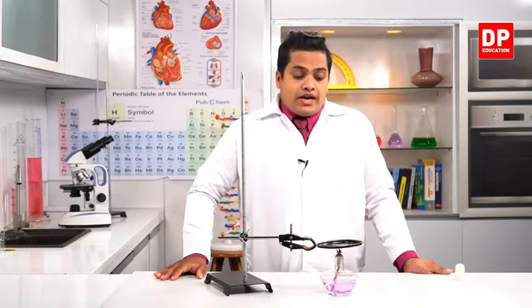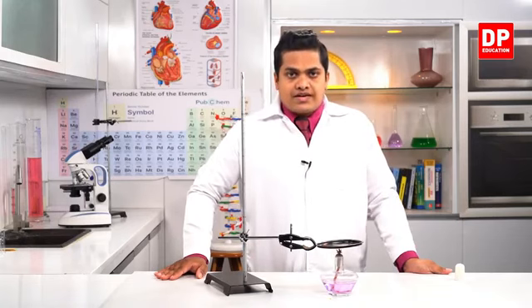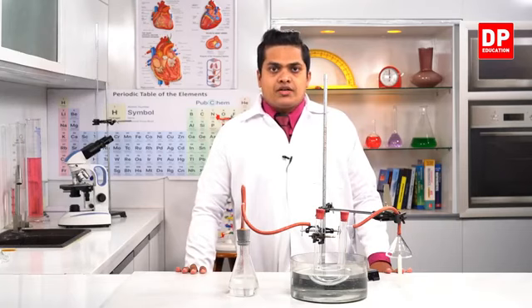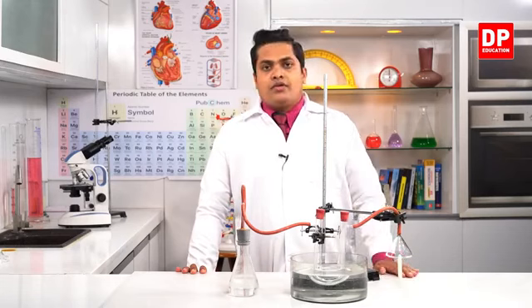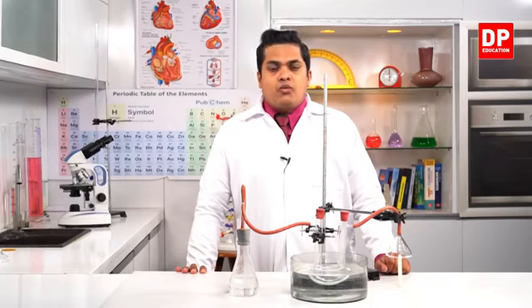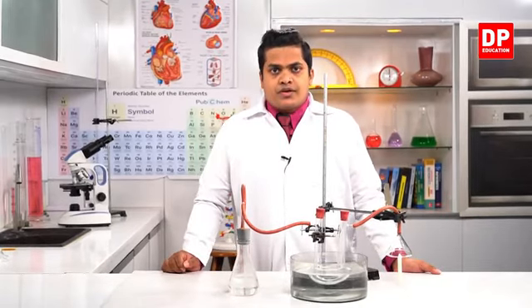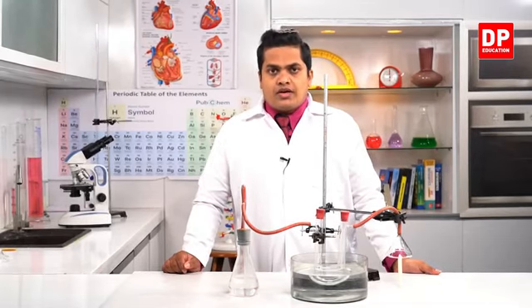Then we'll head on to the classroom once again and write down our observations and conclusions from this activity, my dear children. Now in this activity we'll be studying the products created during the combustion of a fuel, especially the combustion of a candle like this. What are the products which are getting created? I have prepared an apparatus here with several materials. One by one I'll let you know what these things are.